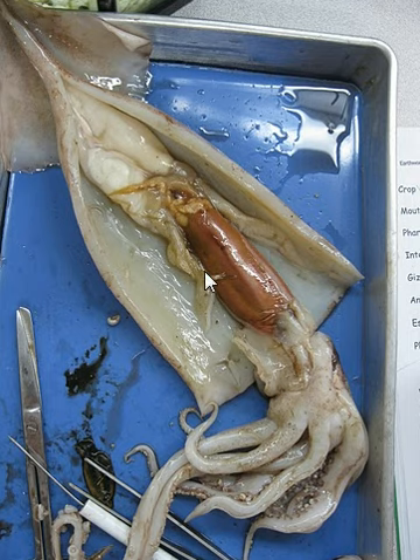The liver is larger, and the ink sac is right here. The ink sac is right here and it is considered small.